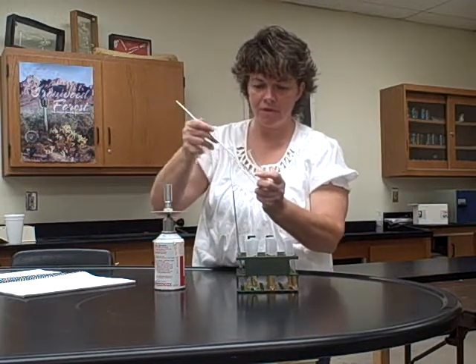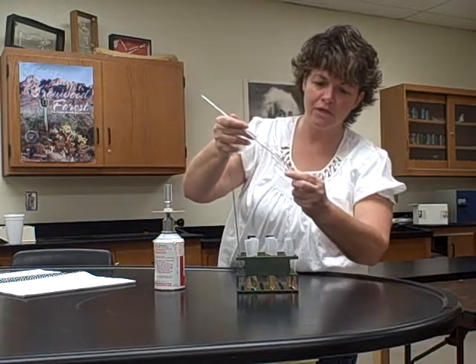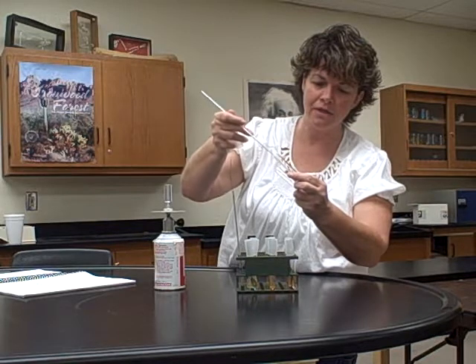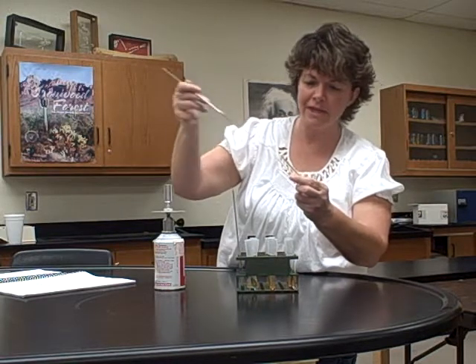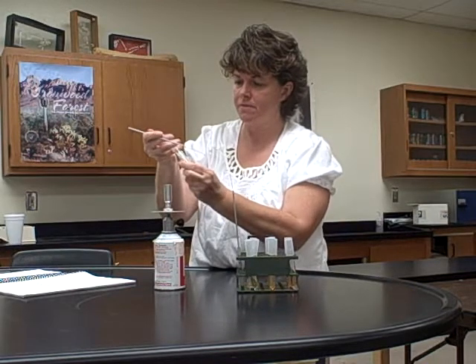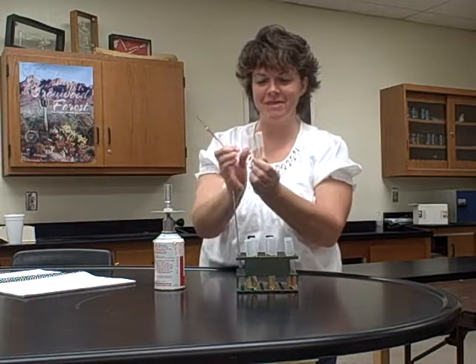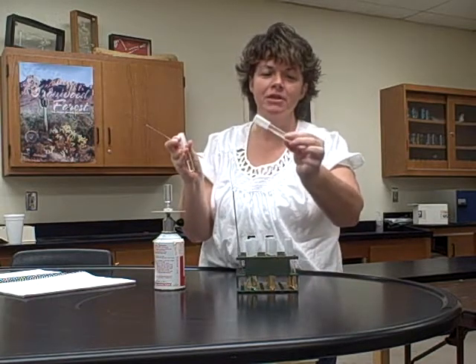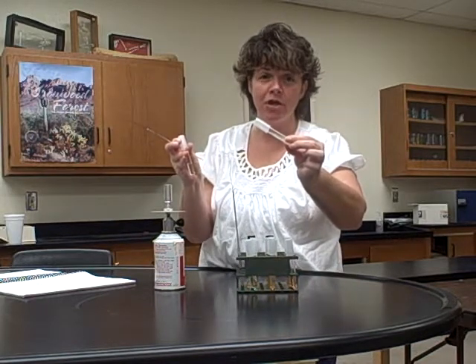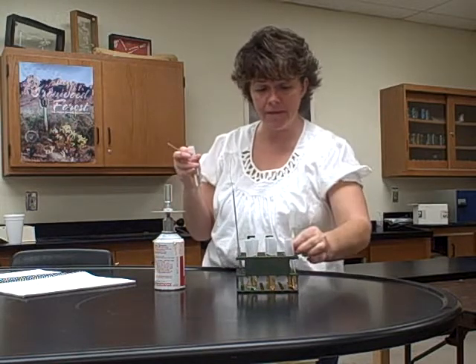I'm going to go into my culture, and then to put it on the slant, you're going to start at the bottom and just gently run it along the slant. And you flame them, and then you close it and flame your loop. All right, so when I put it on the slant, you never gouge the agar, you just run it along there from the bottom up to the top, okay?